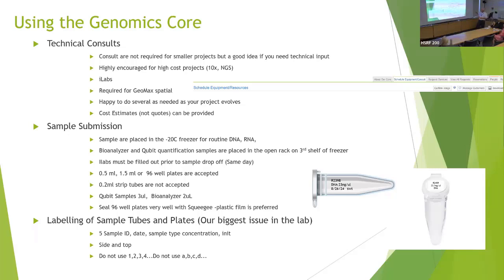So iLabs, please fill out iLabs before you bring the samples down because we still have samples that nobody's ever submitted an iLabs for. And we want to make sure we get your data as fast as possible because we don't want to sit around for 3 days waiting to do it. But sometimes people go, I'm going upstairs right now to fill out my iLabs, and then they don't. Now we're sitting there going, where does this data go? So please do that.